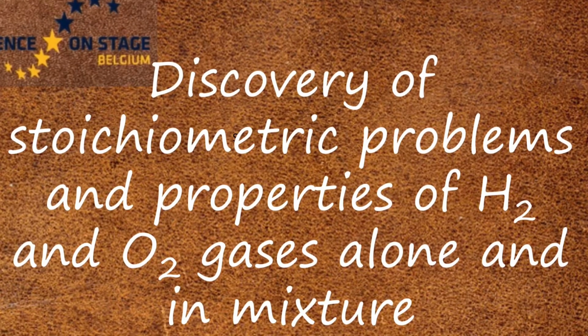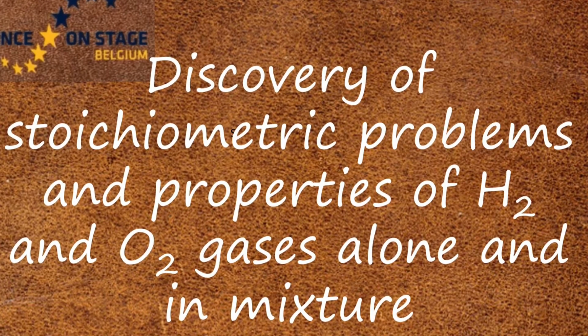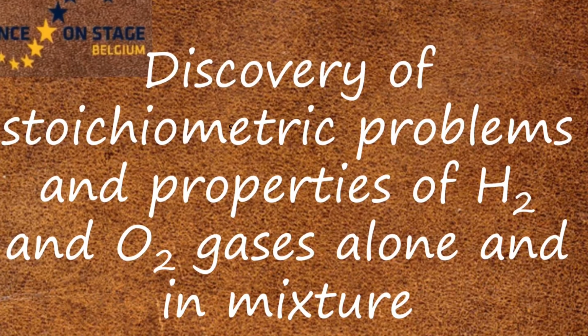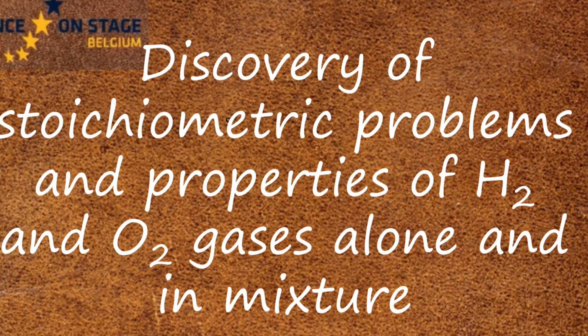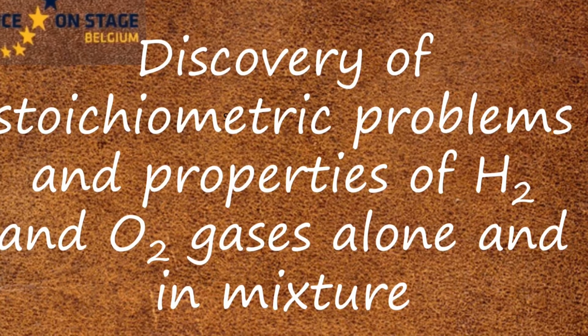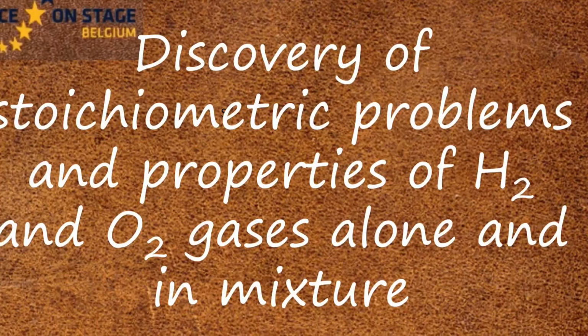Hello. The first time my students see a stoichiometric problem, they have a reward. They do the manipulation of the problem, and then they can see the properties of dihydrogen and dioxygen, the gas alone and in mixture, in the explosive mixture, and then they like the explosive bubbles.